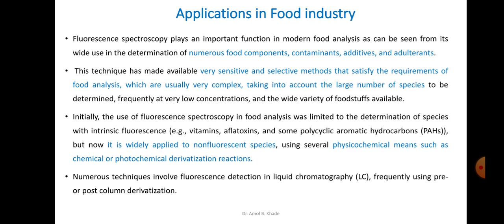There are numerous techniques involved in fluorescence detection, and usually we take help of liquid chromatography, or even nowadays capillary electrophoresis, which are separation techniques. These complex substances, foodstuffs or even pharmaceuticals, we can initially purify, and once we purify, the purified components are subjected to fluorescence spectroscopy for better accuracy and precision.